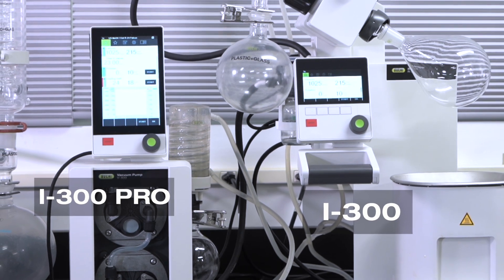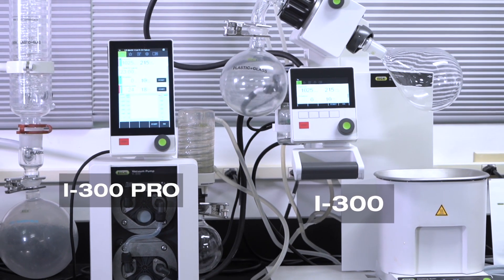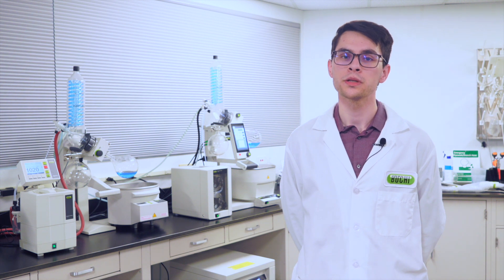The I100 regulates the V100 with on-off control, meaning the membrane pumps at full speed until reaching a set point when it stops pumping. Conversely, the I300 and I300 Pro regulate the V300 and V600 by speed control, meaning the membrane speed slows down as the system nears the set point, creating a gentler evacuation and quieter operation. For more information on how the I300 Pro and I100 control our membrane pumps, check out the video "Operating Modes of Buki's V300 and V100 vacuum pumps."